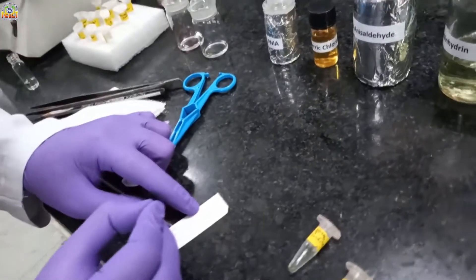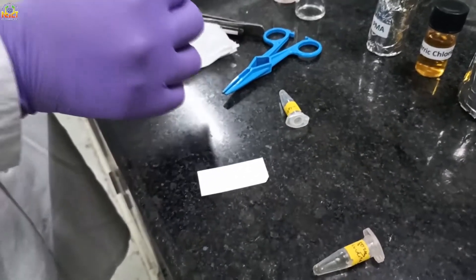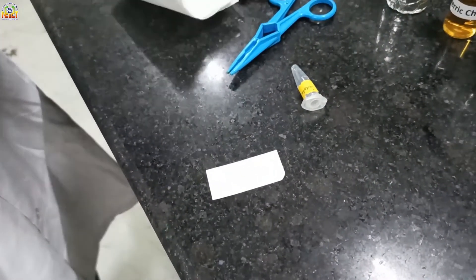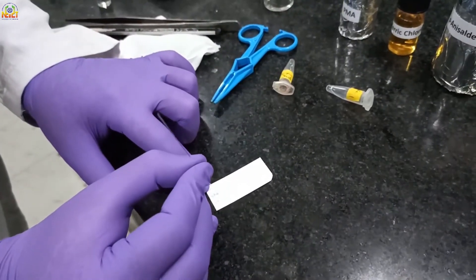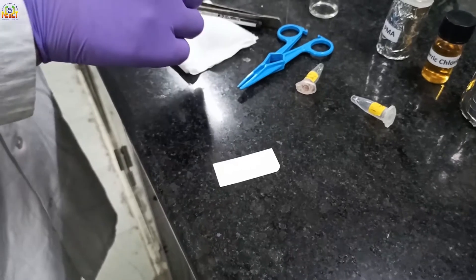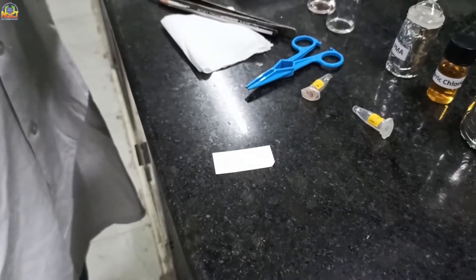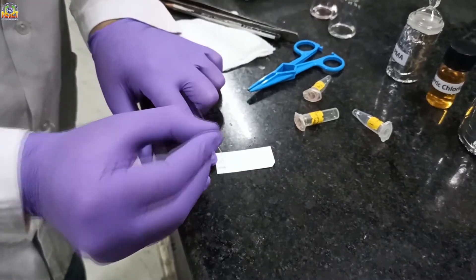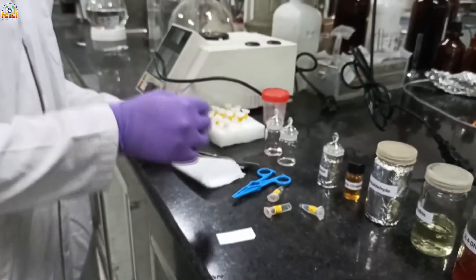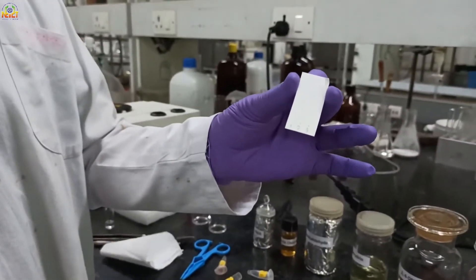The compounds should be diluted to an appropriate concentration — not too high, otherwise it will be difficult to see a single spot on the TLC, and not too diluted, otherwise it won't be visible. I am spotting the organic compounds on the TLC plate using a small glass capillary. No spot is visible by naked eye on the TLC plate.